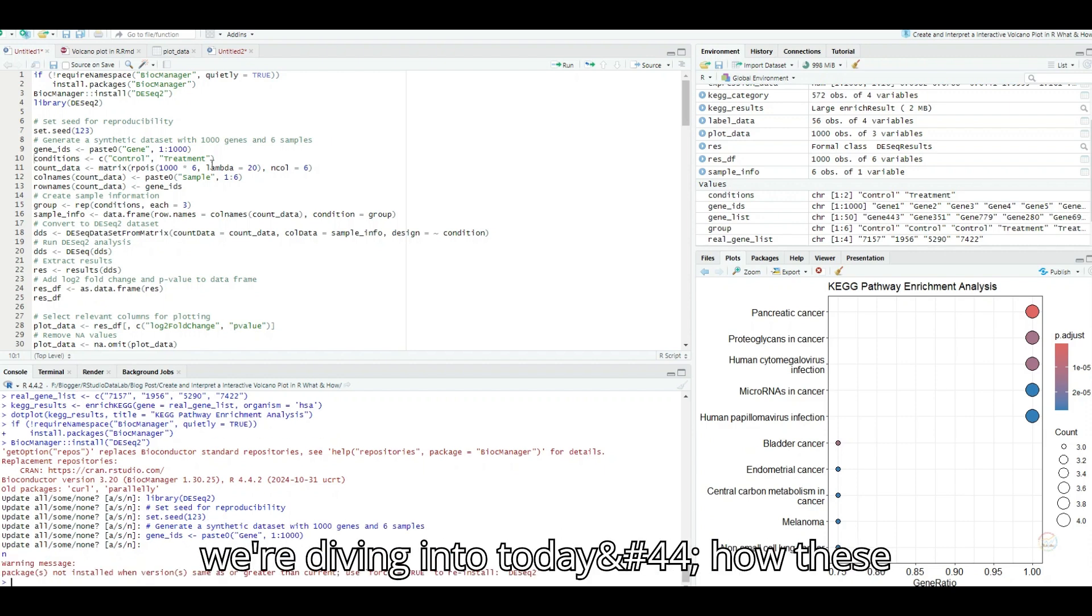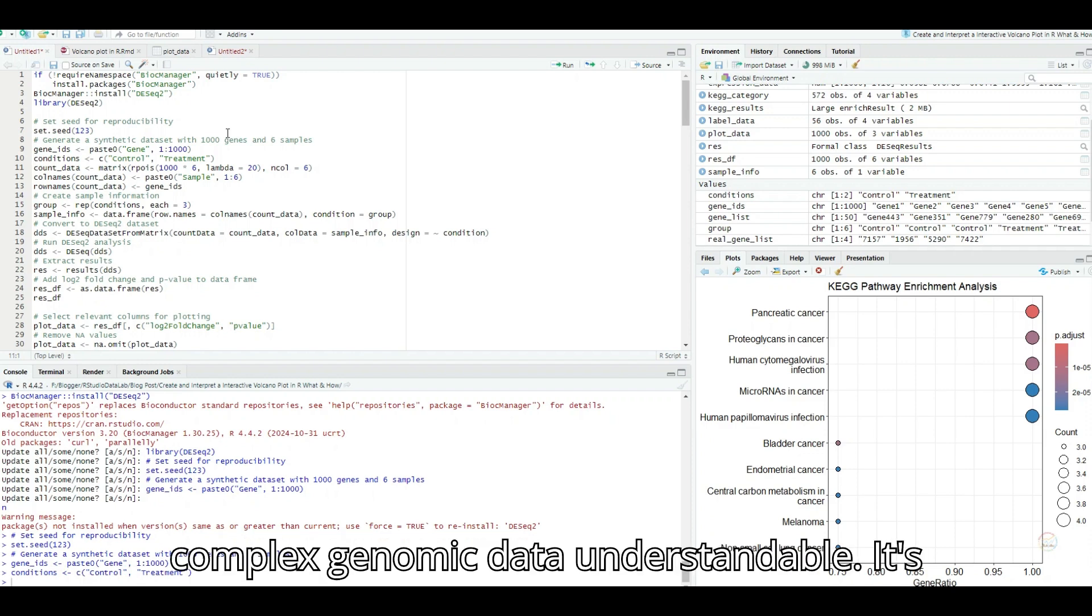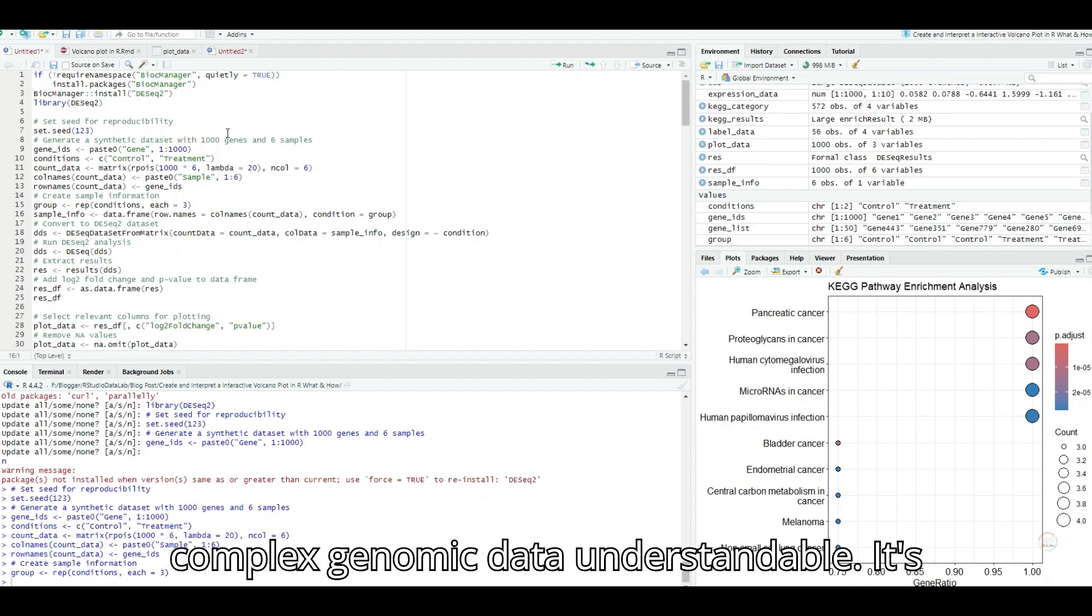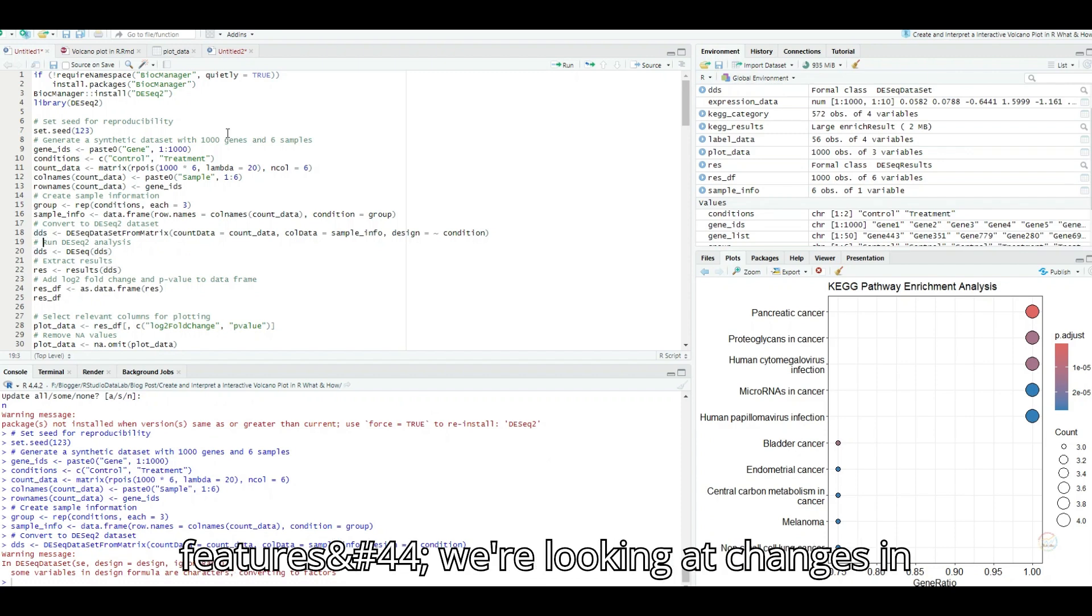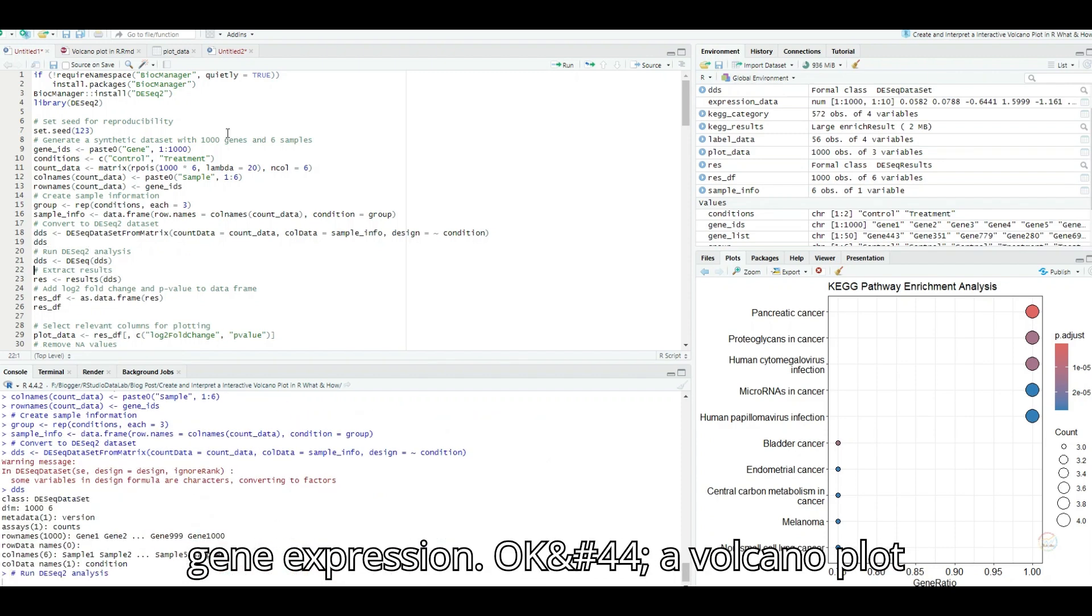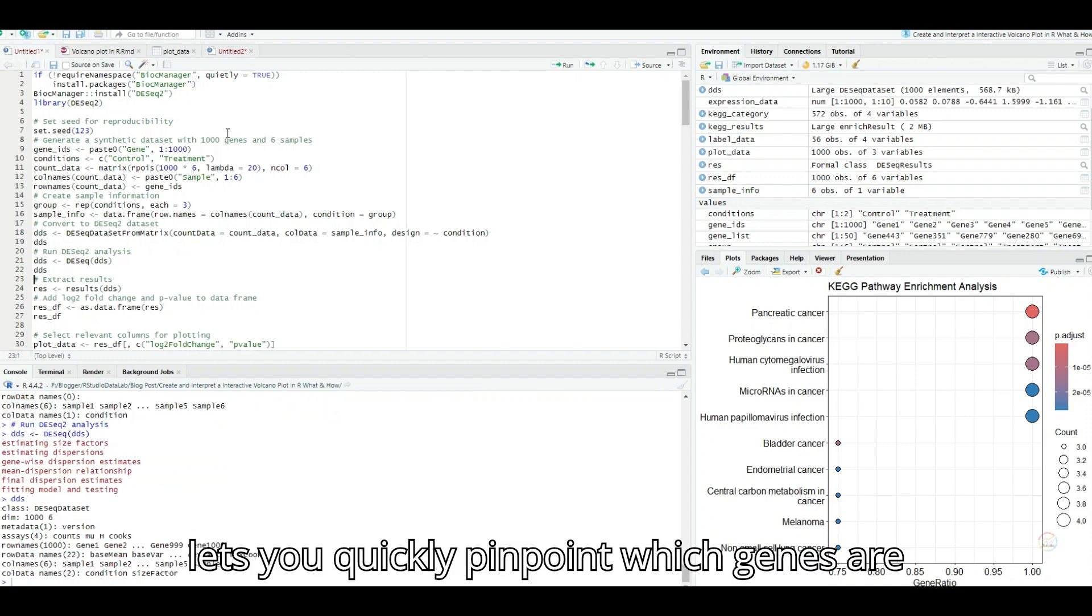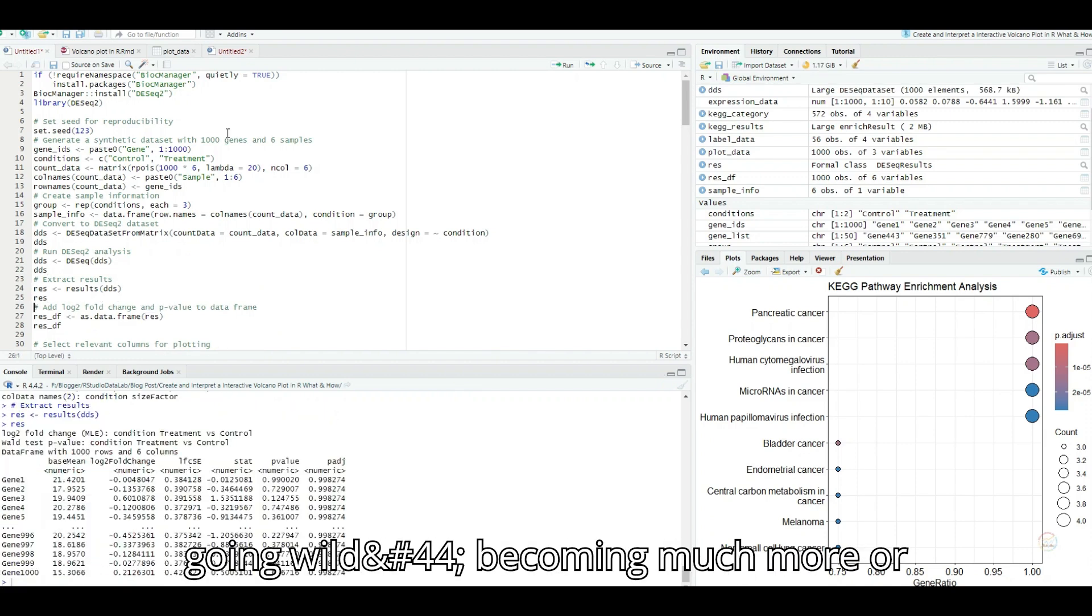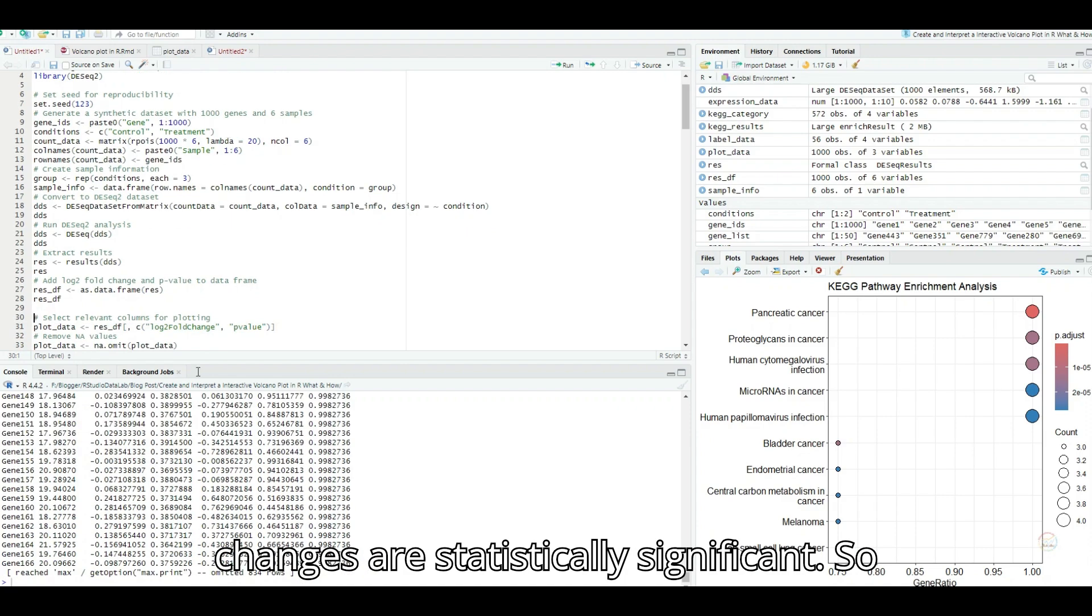It's a great analogy. Instead of geographical features, we're looking at changes in gene expression. A volcano plot lets you quickly pinpoint which genes are going wild, becoming much more or less active, and whether those changes are statistically significant.